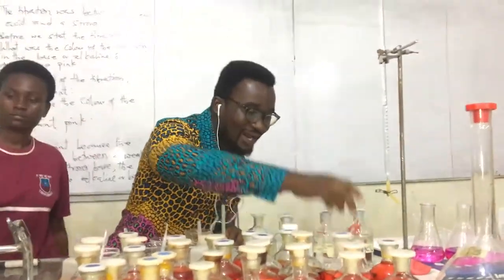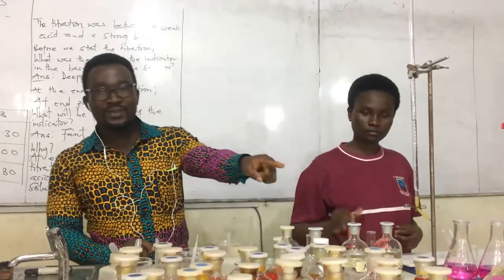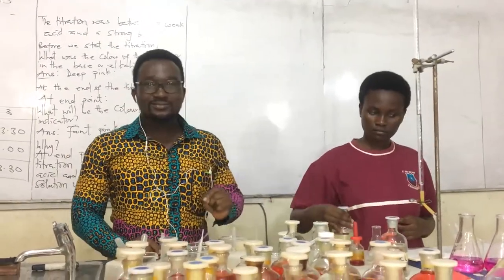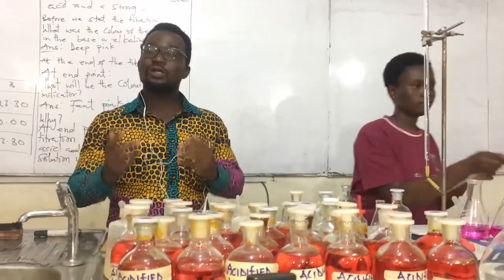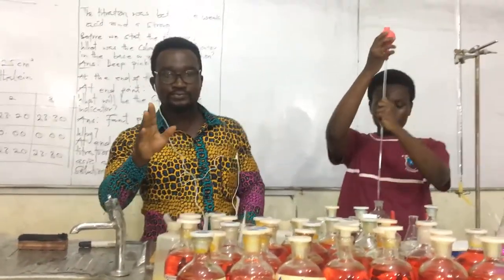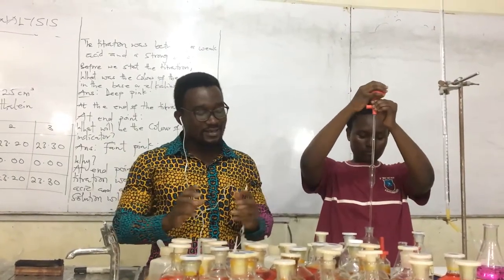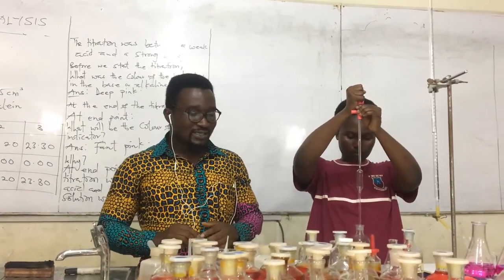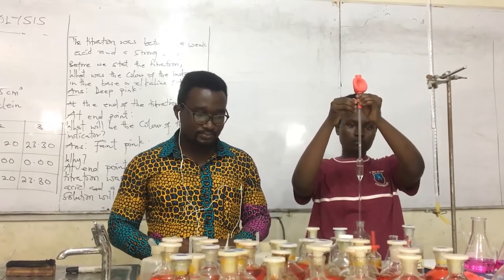So, as you can see, she's going to run another one. You see, from the yellow to the orange is very slight. Just a slight change. That is what mostly confuses people. That is what even confuses the other people who want to discuss the color change and the rest.